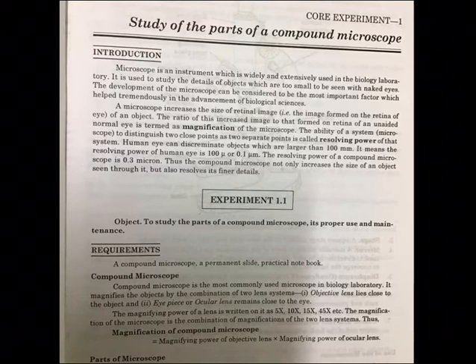It magnifies objects by the combination of two lens systems. One is called the objective lens, which lies closer to the object, and the other is the eyepiece or ocular lens, which remains close to the eye through which you are seeing. The magnifying power of a lens is written on it, as you have noted, like 5x, 10x, 15x, 45x. The magnification of the microscope is the combination of the magnification of the two lens systems.